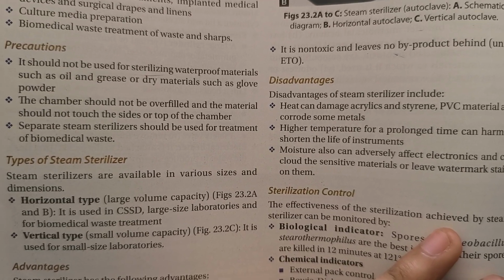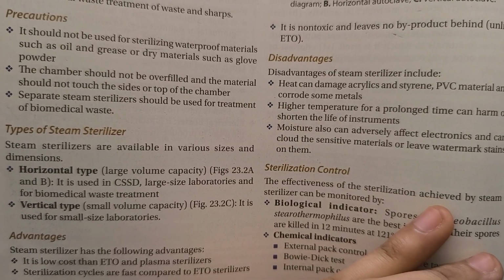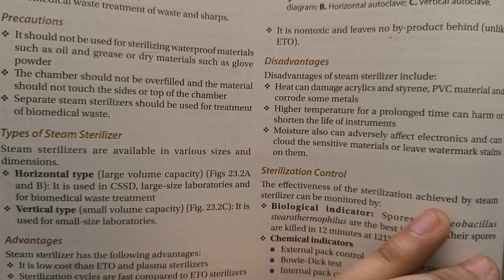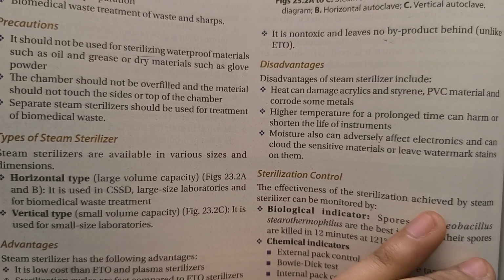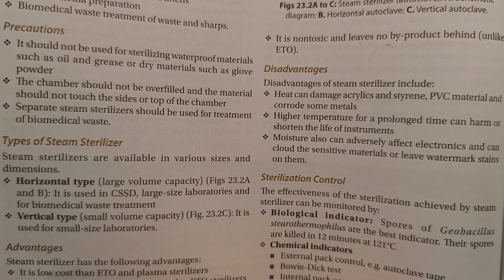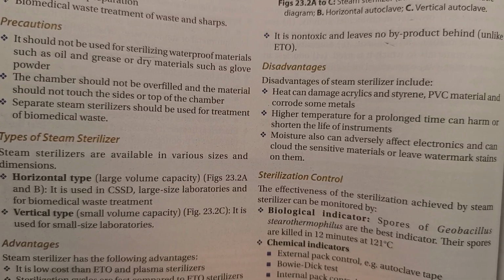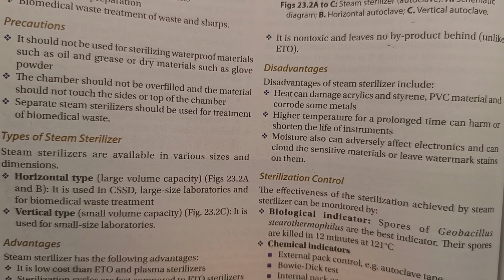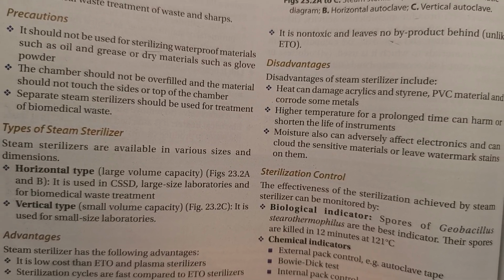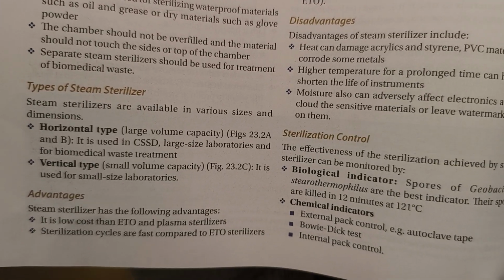Precautions. It should not be used for sterilizing waterproof materials such as oil, grease, or dry material such as glove powder. The chamber should not be overfilled and the material should not touch the sides or top of the chamber. Separate steam sterilizers should be used for treatment of biomedical wastes.